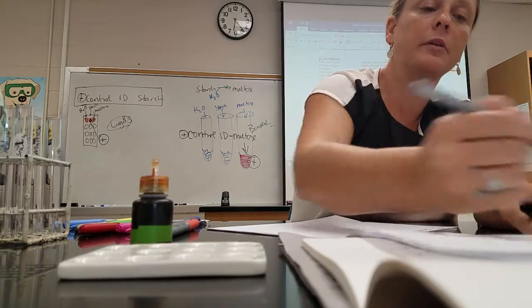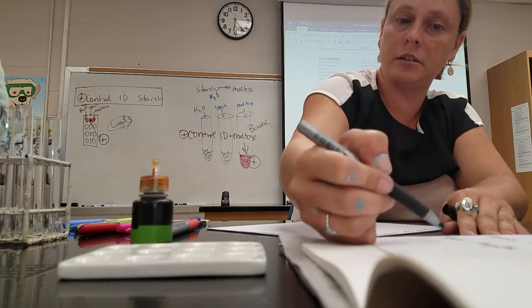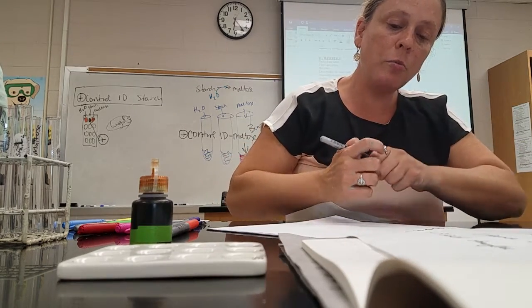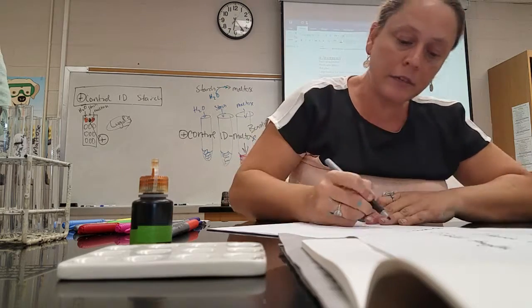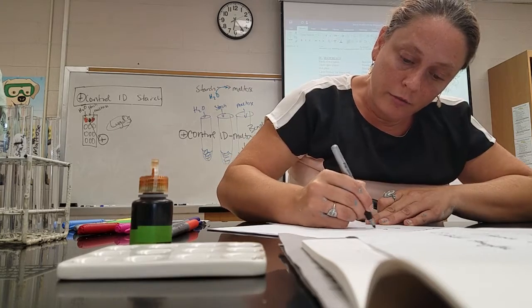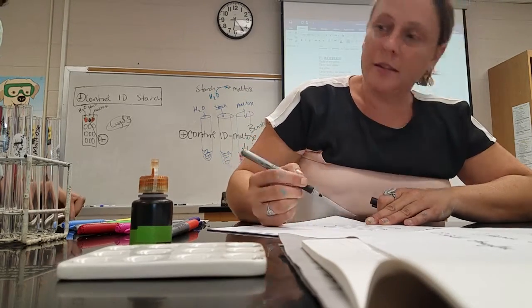We know what we're doing with amylase. We need reagents to figure out what is going on in each of these situations. Where is starch, maltose, is it just water? You see? So for the control for maltose at the end, you're going to have to take 3 test tubes. So you've got your water bath boiling, good. Have you gotten your control tubes ready? No, I didn't know what to put in. It's like 2 milliliters.